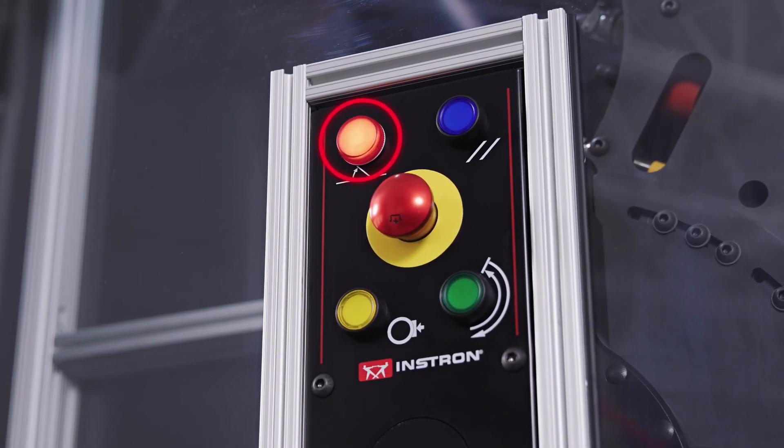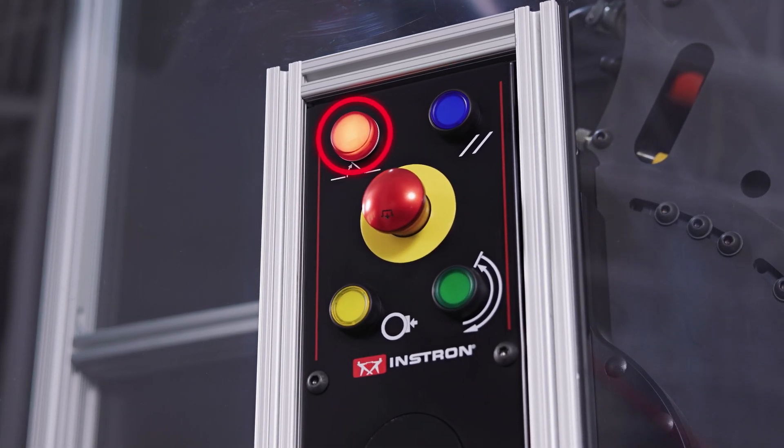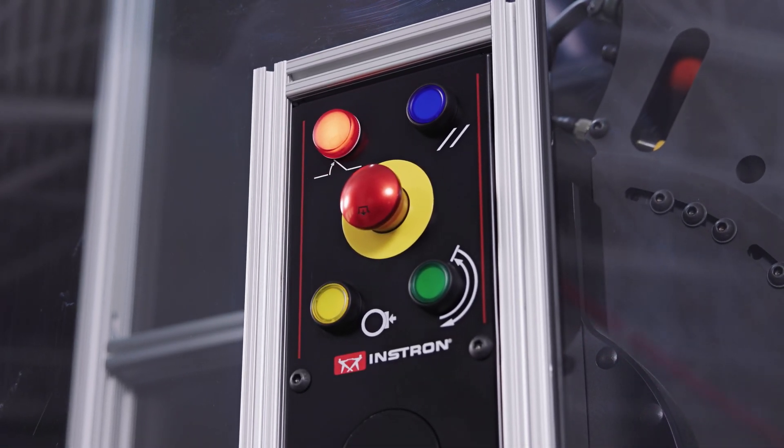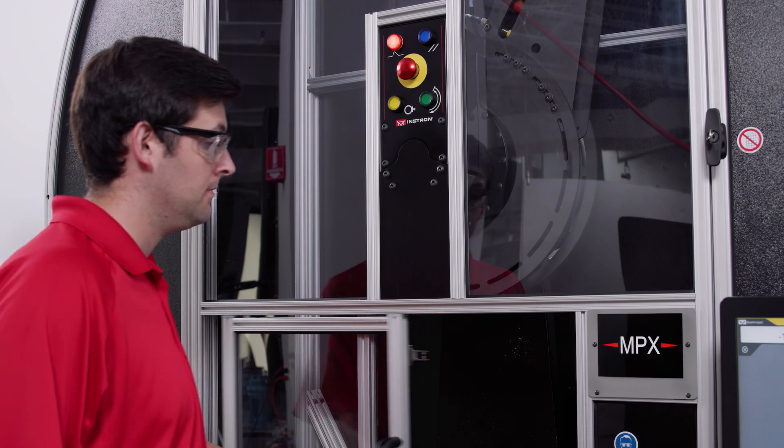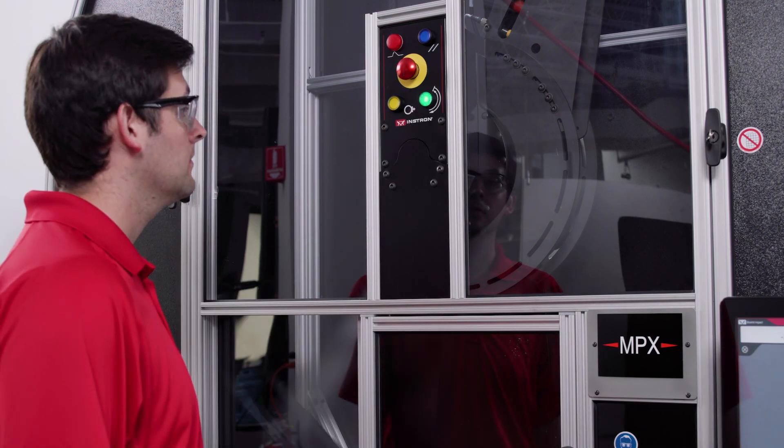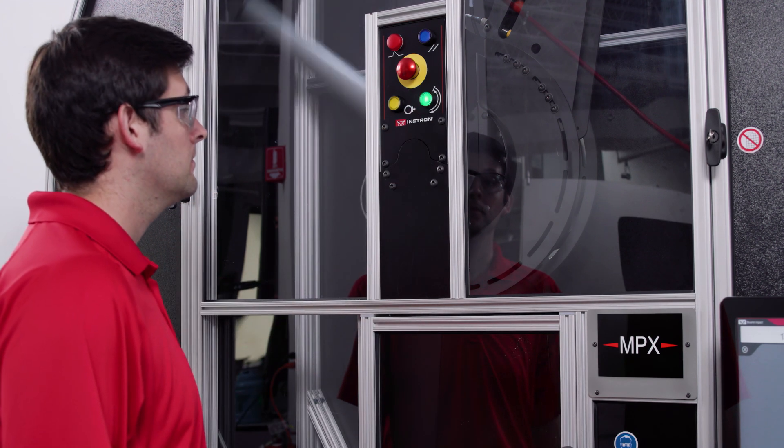The red indicator light on our control panel lets us know when the system is not safe to use. Once all the doors are closed, we simply hit the green button on our control panel to run our test.